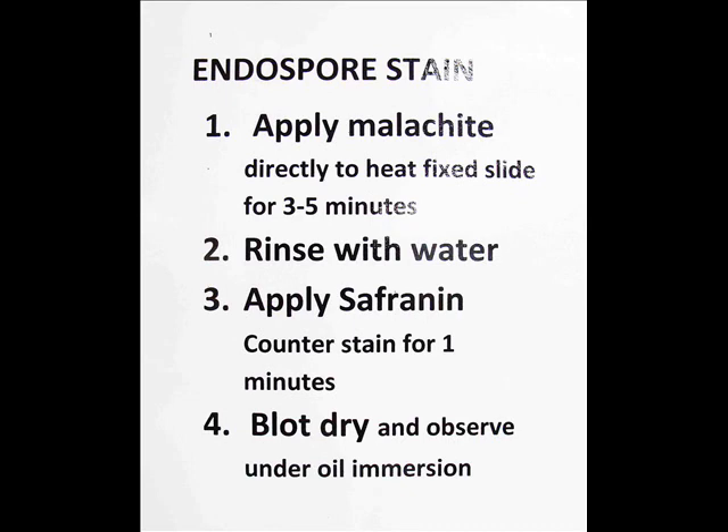The first step is to apply the primary stain, malachite green. This is done over a water bath for three to five minutes. The heat from the water bath will drive that green stain into the endospores.